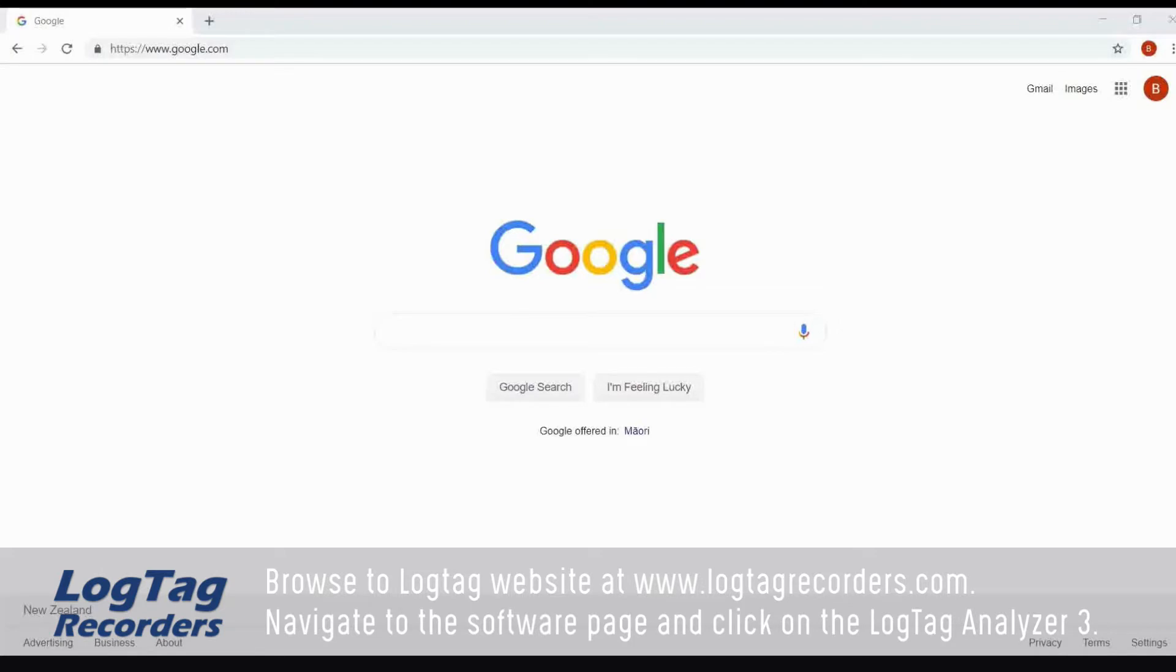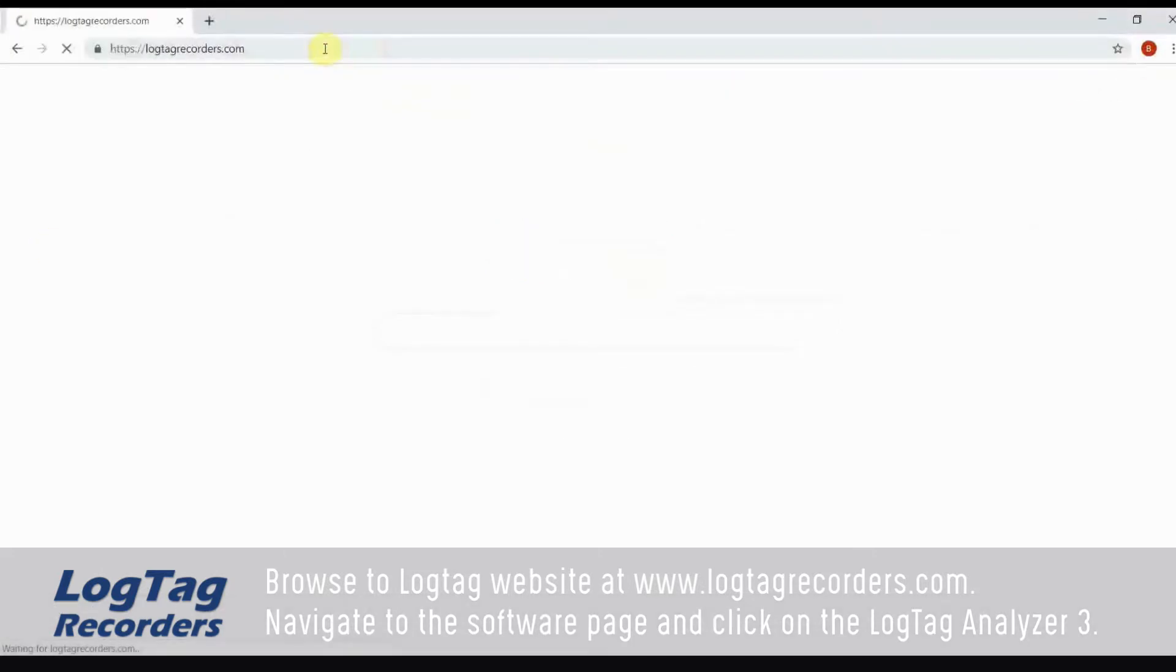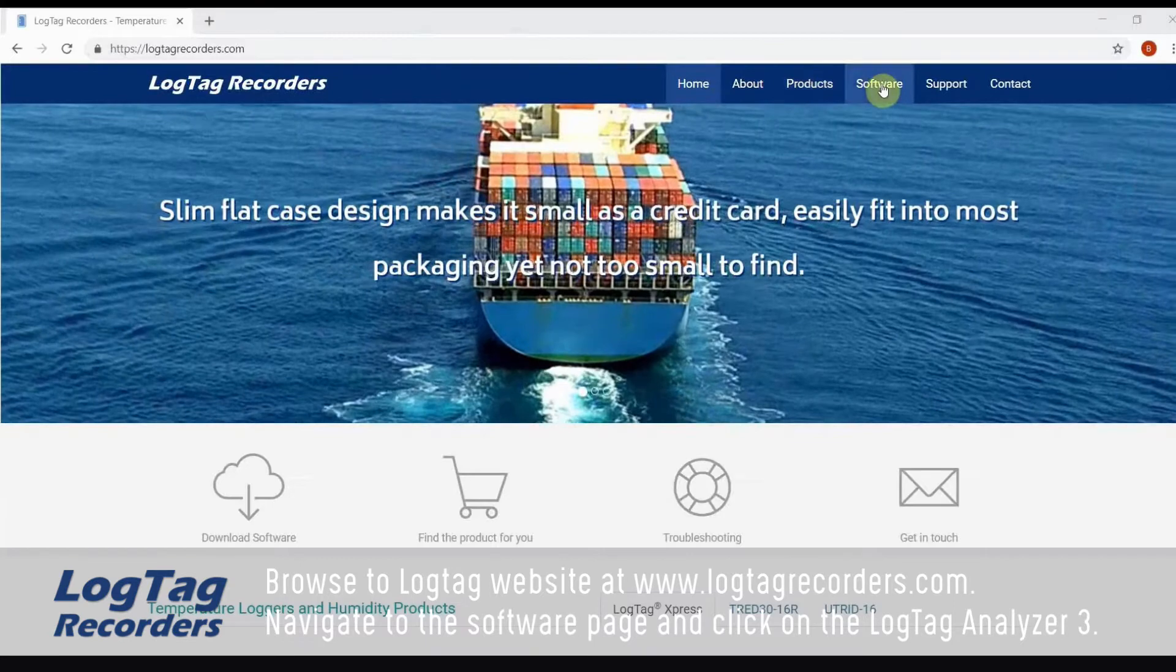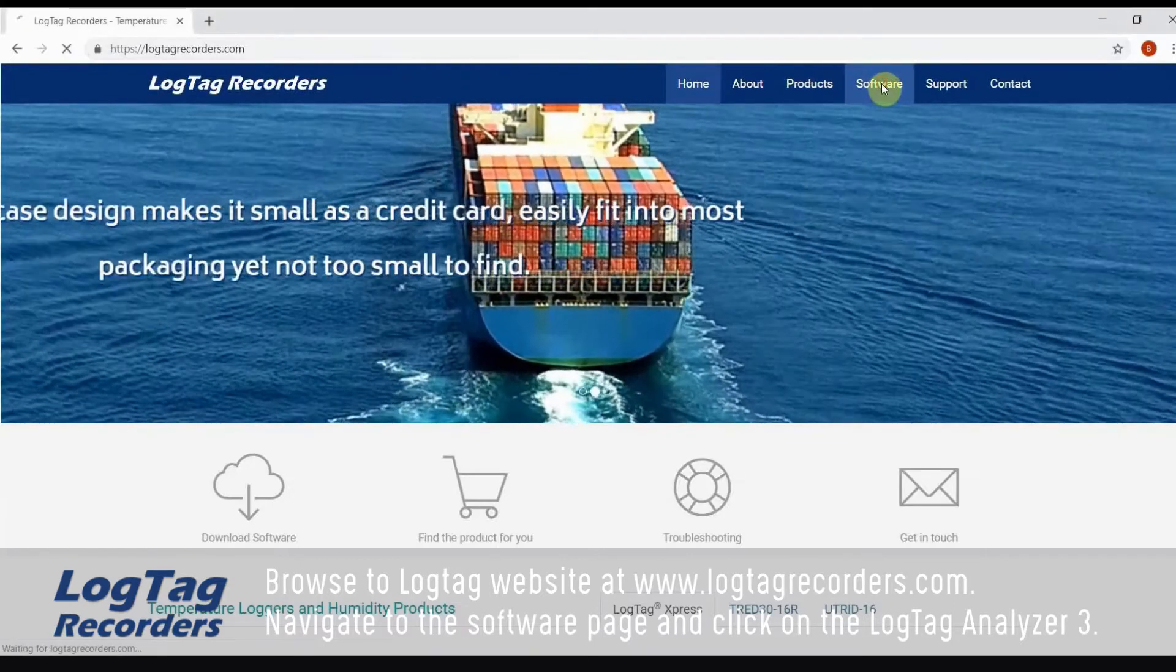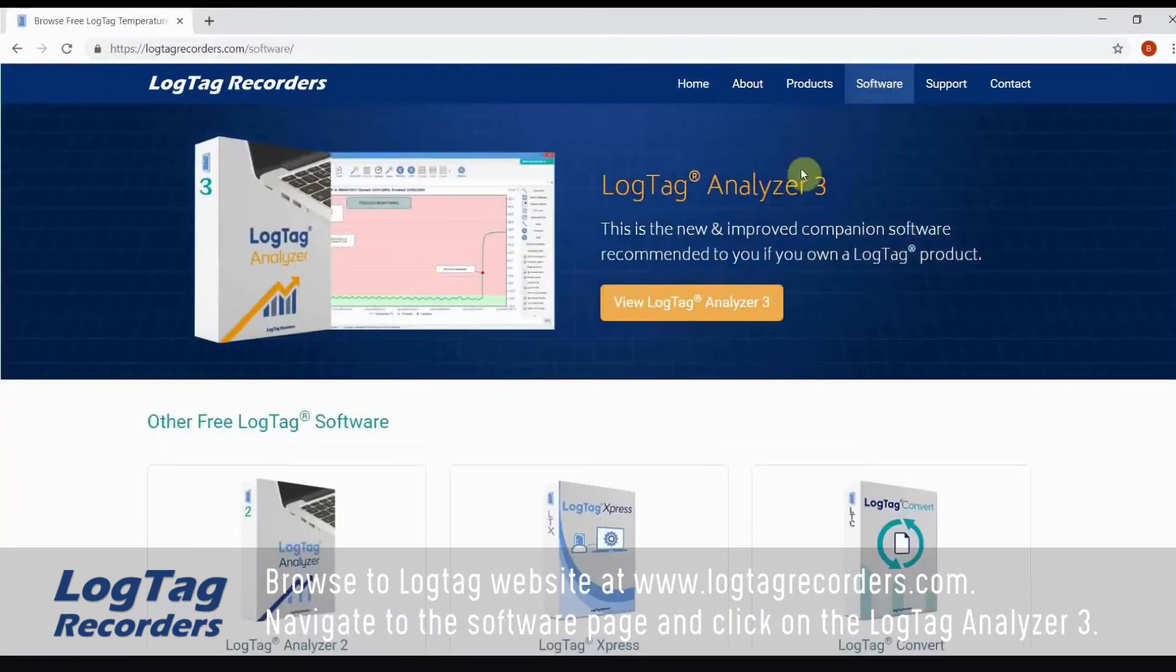Browse to LogTag website at www.logtagrecorders.com. Navigate to the software page and click on the LogTag Analyzer 3.